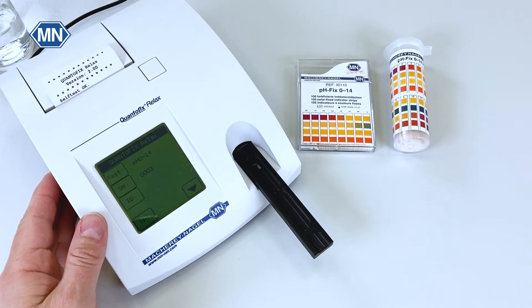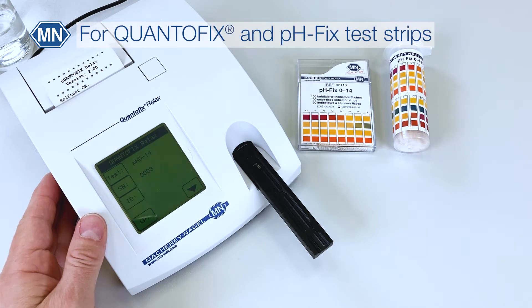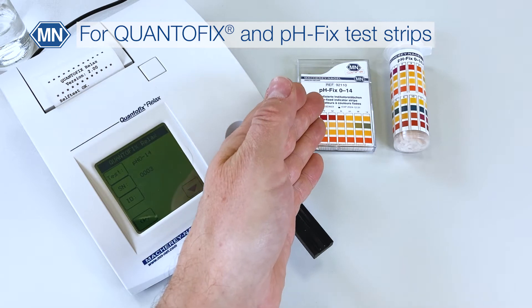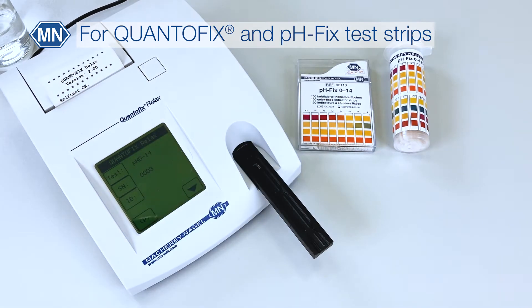The Quantofix Relax is an easy test strip reader that reads Quantofix test strips but also a variety of pHFix test strips. Please note that it works with standard test strips — you do not need to source special instrument test strips.